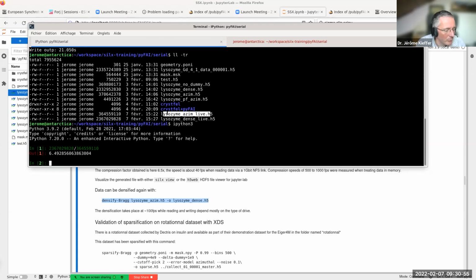We are injecting a lot of random values in order to have software like XDS accept those data. If the data were clean without any noise, XDS would just complain and say that the data is garbage, because the noise doesn't look like what it's expecting. So we are regenerating the noise so that XDS agrees to process the data.